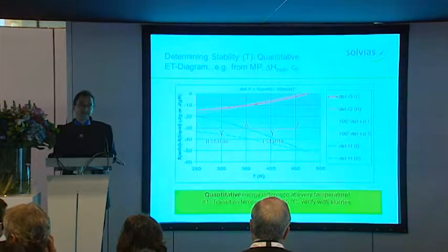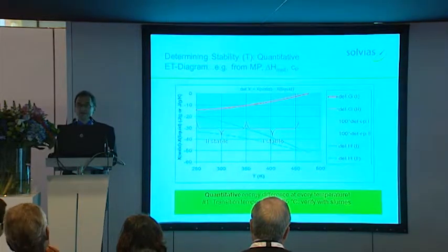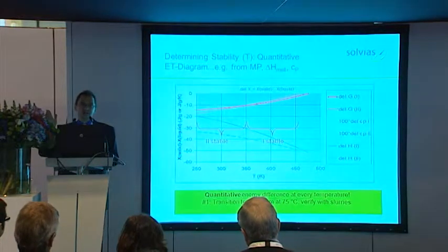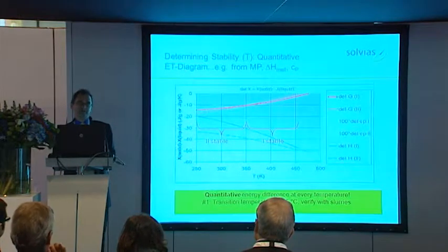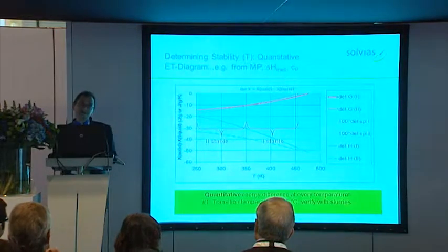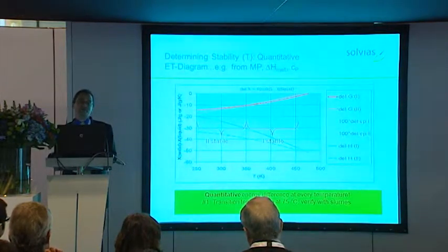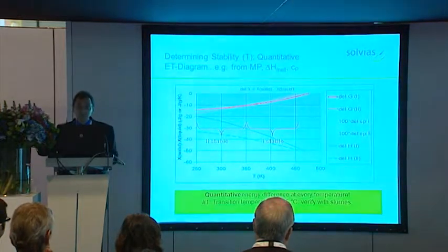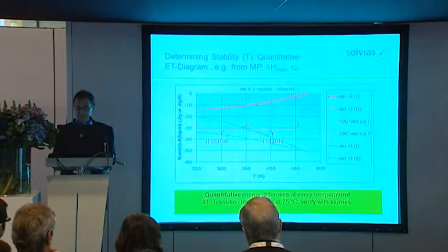We see here it is 75 degrees, so that means immediately it's probably advisable to start the crystallization at a temperature lower than 75 degrees. Or if you start the crystallization at a higher temperature, you have to take care that there's no form conversion during the crystallization.